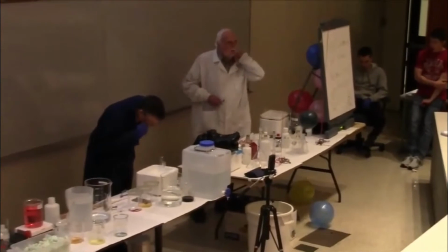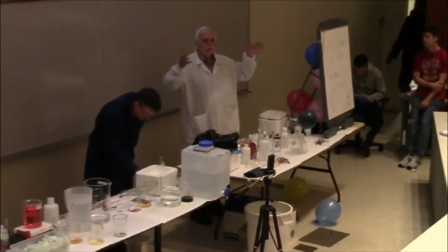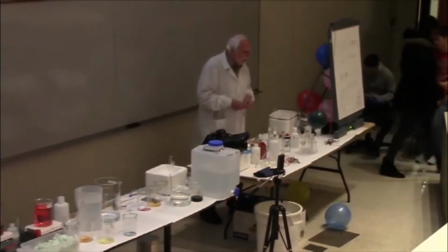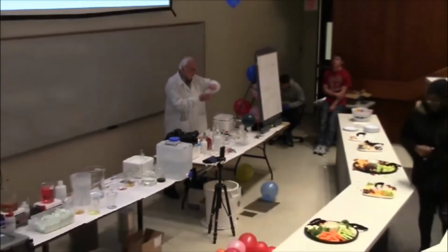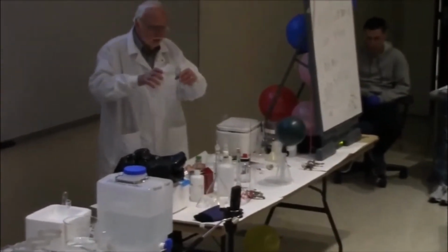This experiment again involves carbon dioxide, but we don't want to bring in a big cylinder of carbon dioxide gas, so we're going to use dry ice, which again is just a solid form of it. So what I'm going to do is put some water in this flask, but I made the water a little basic. I added a base for the purpose of this experiment.